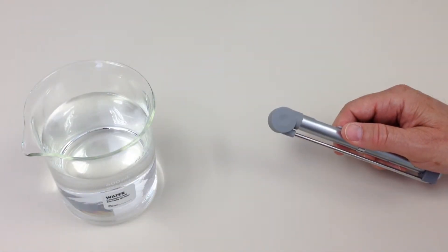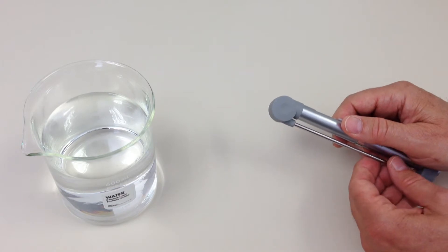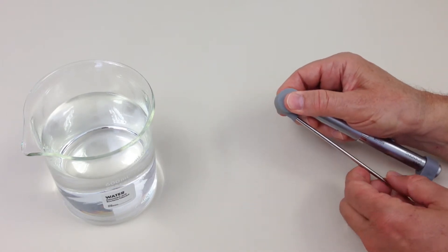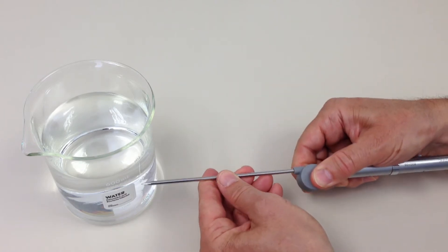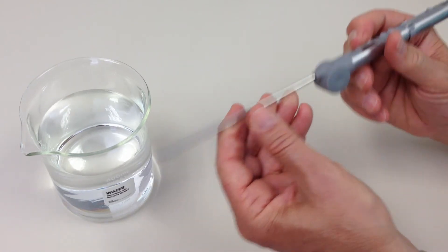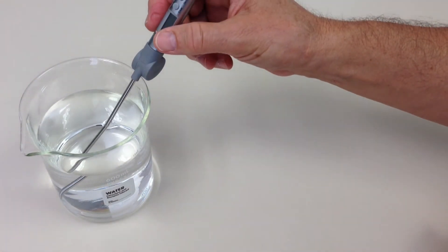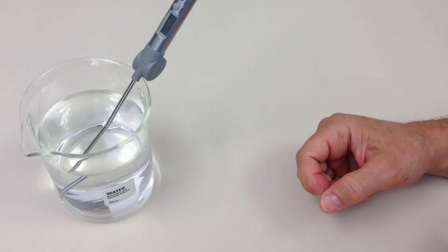For penetration temperature measurements, a thermistor probe rotates out from the other end of the pen. The stainless steel probe locks at 90 and 180 degrees and recalls minimum, maximum, and has a hold function.